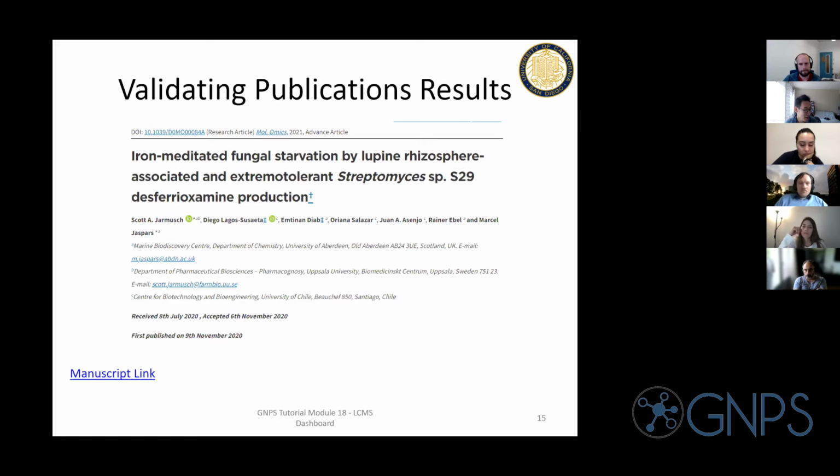At least one thing that we've done is, we created this maybe 6-8 months ago. And once it was minimally functional, we were just going out, new papers came out, and we were looking to see, hey, can we reproduce this? This is great.